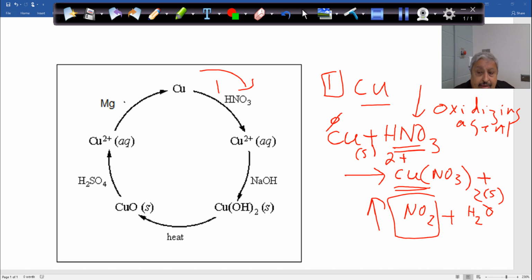So we move this one here. If there are some pieces inside the beaker, just add more nitric acid and stir a little bit, if that's the case. But I think nitric acid will take care of this. It's very aggressive. It will dissolve this one here.